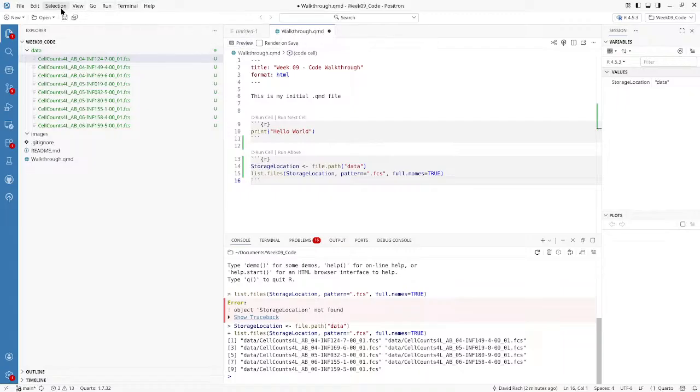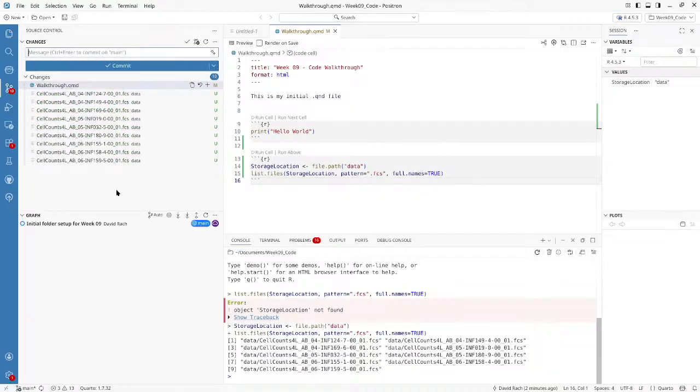I should go ahead and save my walkthrough. And now the last step before you would actually do the first steps of the course is that all these files are now set up. They're all ready to go. Let's just go ahead and send them back to GitHub for version control so that if something happens to our computer mid walkthrough, we're not actually losing anything important.